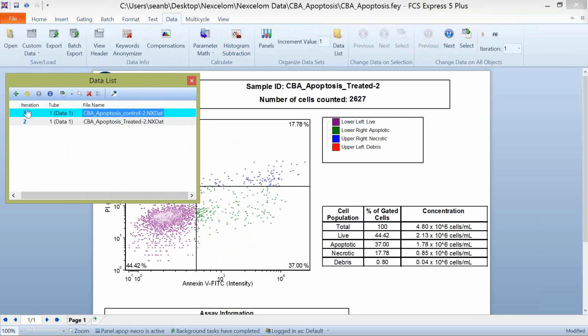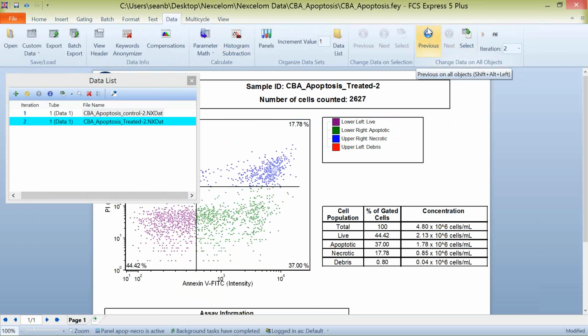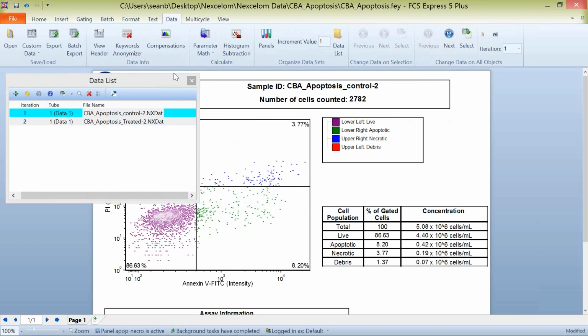file and the next. So I'm finding a lot of the time when we're working with these customers, we show them this feature. They really enjoy it. They seem to think that it's making their life a lot easier, that they don't have to compare data files across many different layouts. So I just wanted to make everybody aware that this is a feature that we can use in here, and we can use next and previous to skip between these data files.